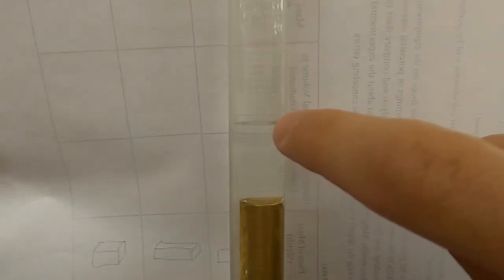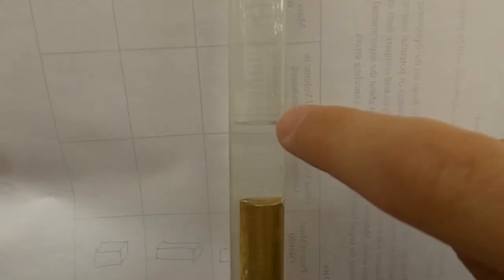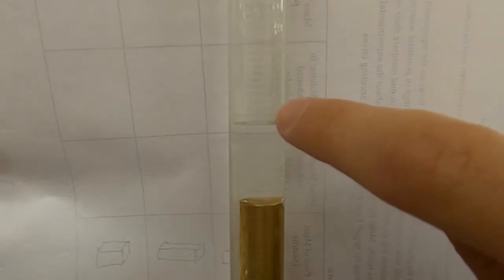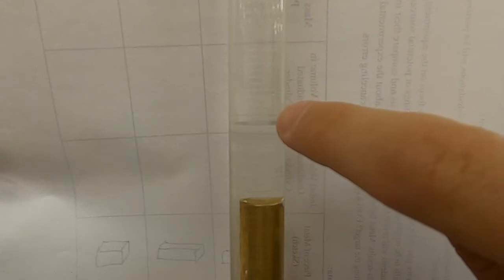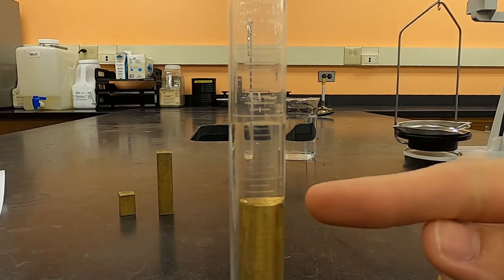So here this is 20, this would be 19.5, and this line would be 19. Our known digits are the 1 and the 9 for 19 milliliters, and our estimated digit is going to be somewhere between 0 and 5 in the tenths place. I'm going to go with 19.2 milliliters.